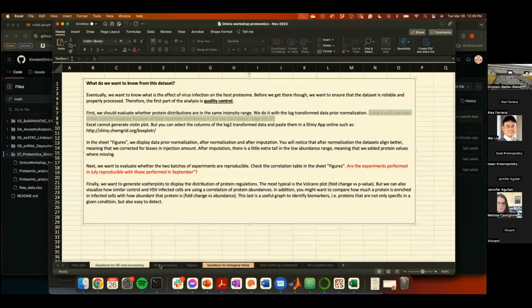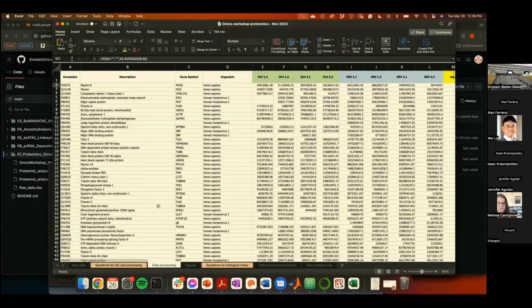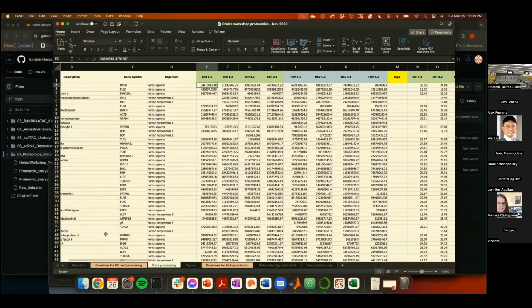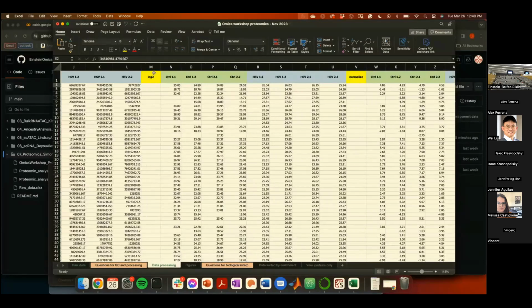One of the more important sheets in this workbook is the data processing. This is what my code is actually going to be doing. I essentially translated Excel code into Python code. The way that I've structured the Python workbook is meant to mirror what is going on here. So we start with our raw data, the same as here, and then we're going to start doing certain types of transformations. I will explain why we do these transformations and the result of those transformations. But in the Excel sheet, you can see how those transformations are made for each column.